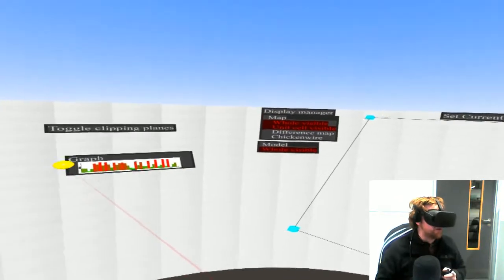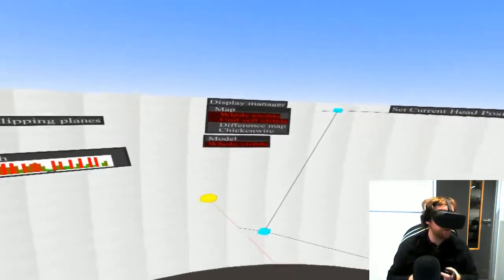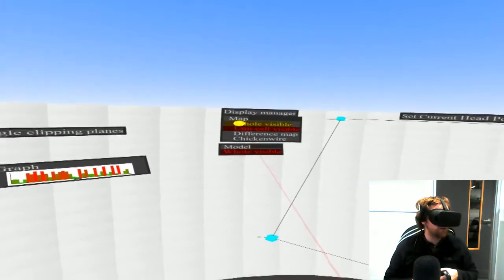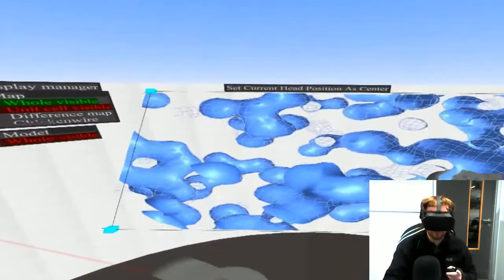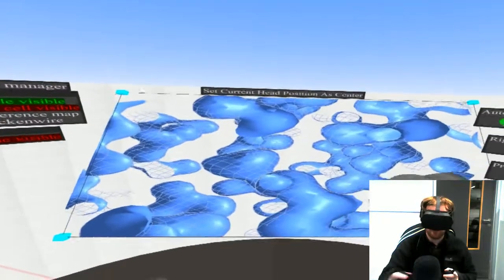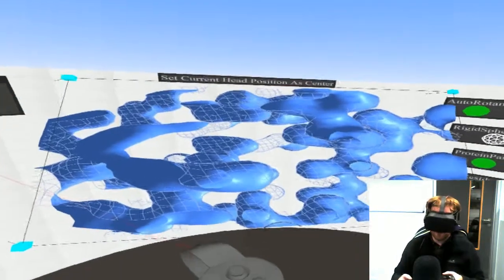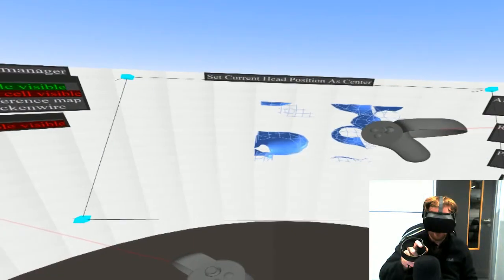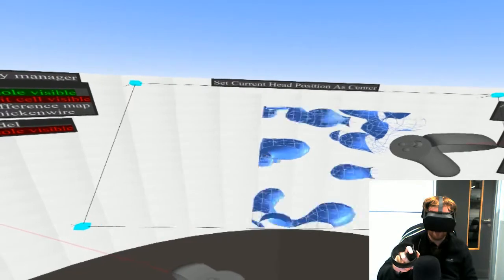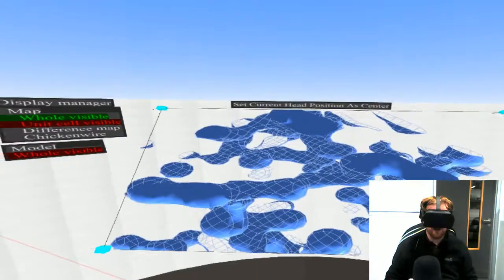Alright, but what is this about? We're interested in model refinement, models of molecules. So here is some data that we have. This came from a crystallography experiment. As you would expect with a program like this, I can change the contour level of my data, decreasing or increasing the contour level. I can't remember which, but it's very useful to be able to do that.